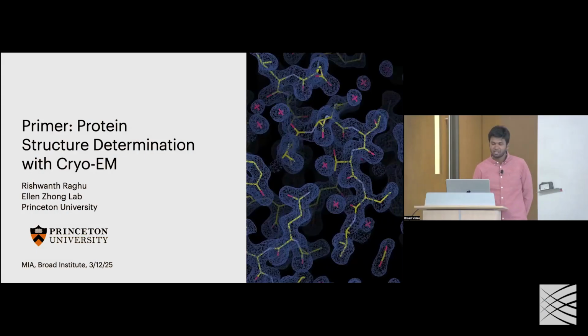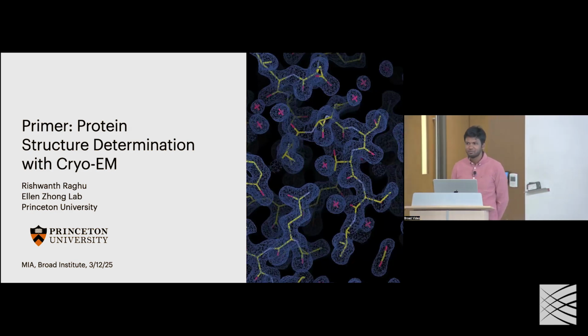Hi, everyone. Today's topic is protein structure determination with cryo-EM. Cryo-EM as an experimental technique has existed for over half a century, but it's really been growing in popularity probably over the past decade, both amongst biologists who want to push forward discovery, but also amongst computationalists who are faced with new challenges in processing the data.